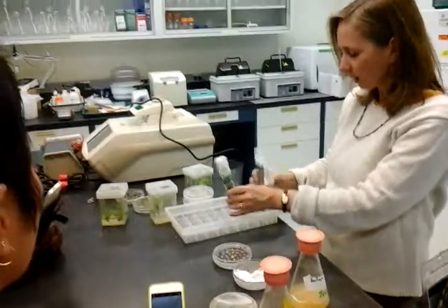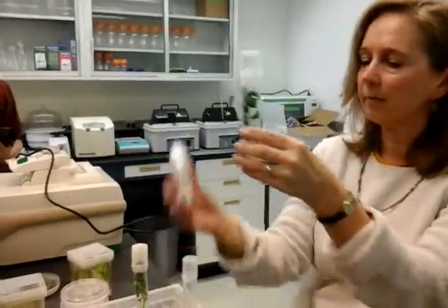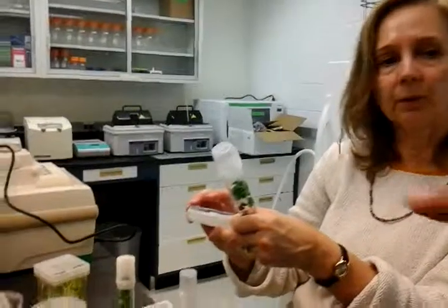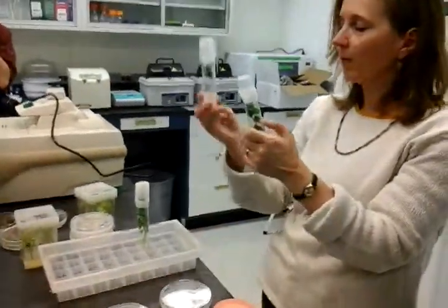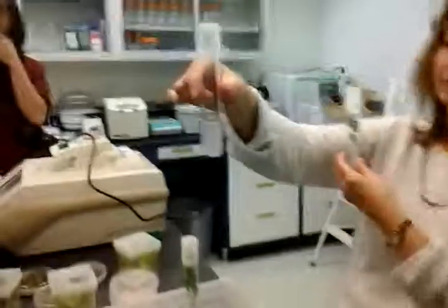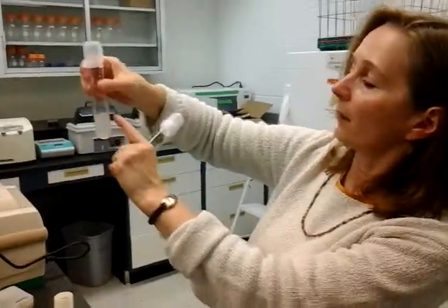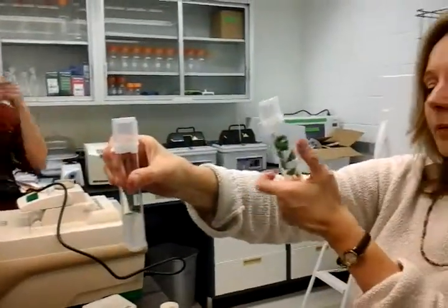Potato is similar, but because potatoes don't have seeds we start with in vitro plants and take stem cuttings. We take these plants, cut the stems between the leaves, and that's what we infect with the agrobacterium. They go through the same process as tomato. This plant here is about five weeks old — they start out very small, about one week old for the tiny ones. We take a cutting with one leaf, cut the leaf off, put it into the medium, and the axillary bud pushes out and makes the new plant. Every five to six weeks we make new plants from cuttings.